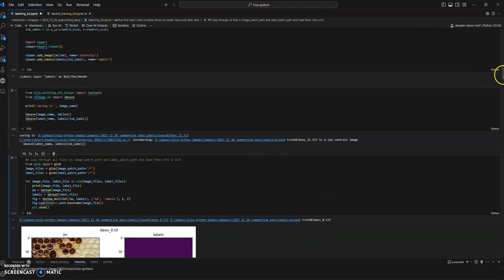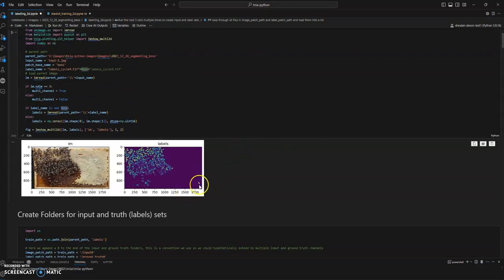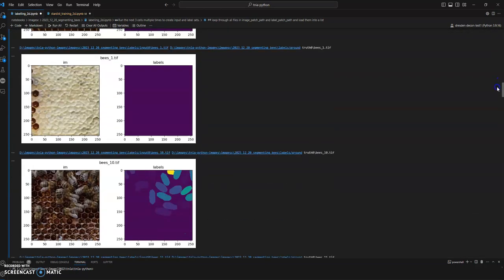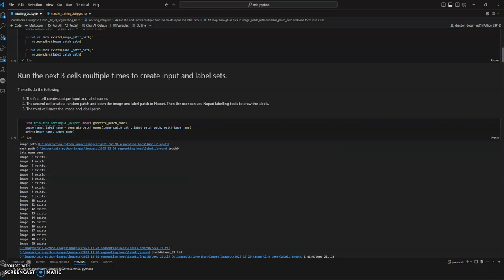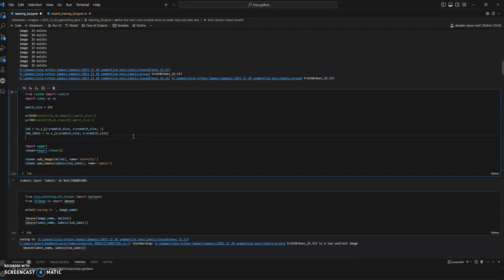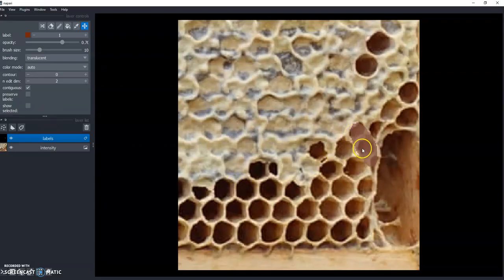The final thing I want to do here is, you notice there's a little guy here that looks like potentially an incorrect one. I paused it again because I wanted to figure out where that was. I noticed there's a little fake one in the corner. 1650, 740. So I start my Napari again, and you can see we have a fake one. Whoops, I want to go to eraser, and we can erase it.